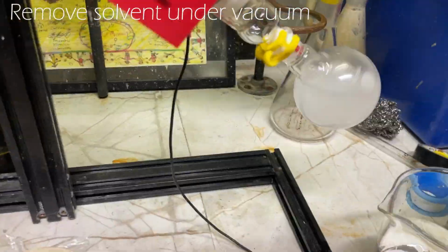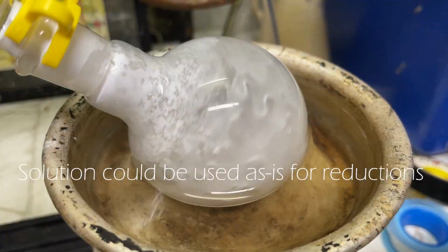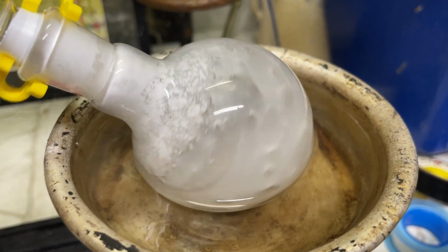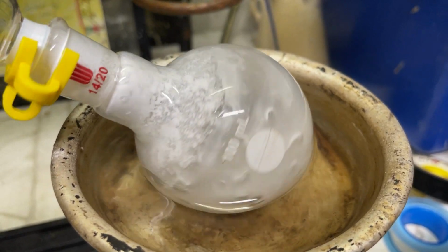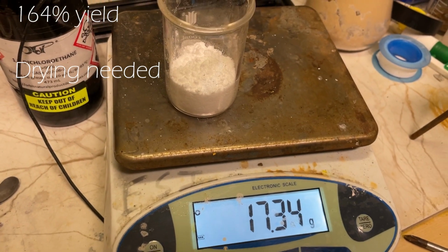And now we just strip the solvent off under a vacuum using a rotovap because I'm fancy. But you could also keep it in the solution, I guess. And here you can see it forms this kind of paste. It doesn't really crystallize nicely. It forms a kind of dust. But anyways, after removing as much solvent as I could, I got 164% yield, which is not correct, of course.